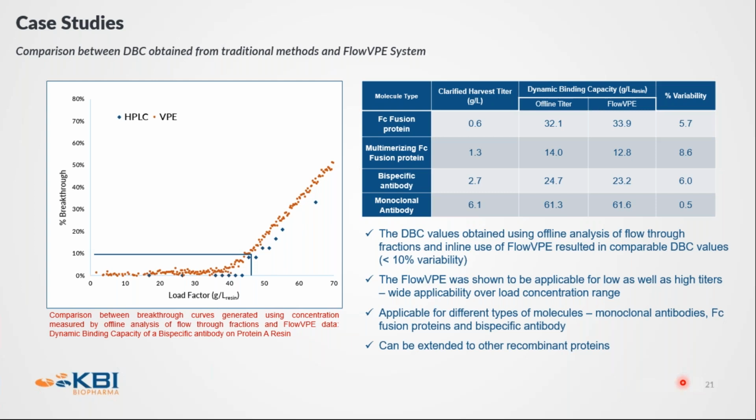And the second reason, I think, which is more important, is that these results can be obtained very fast. So we are ready to take this much of variability because we can save considerable amount of time.